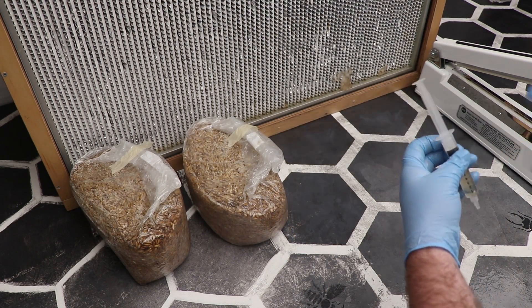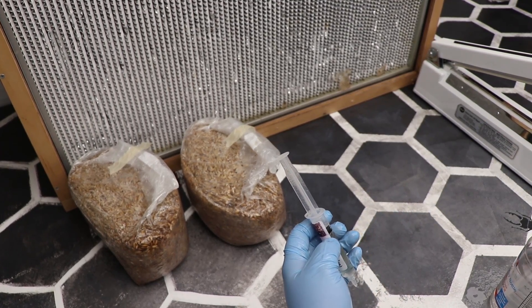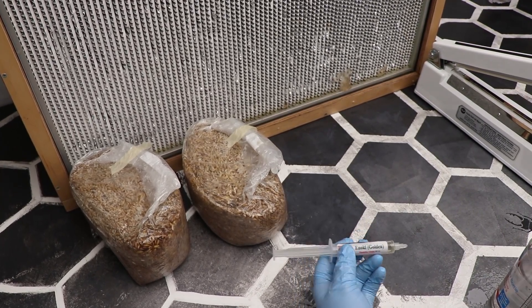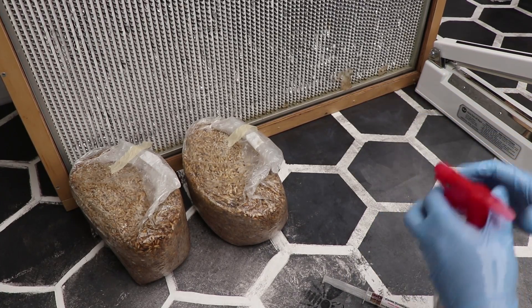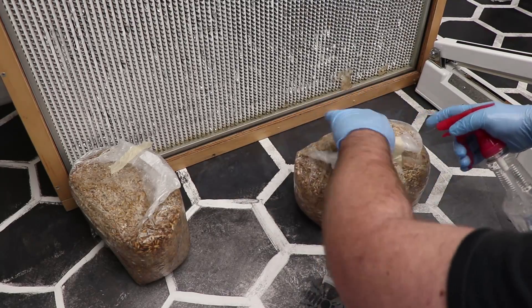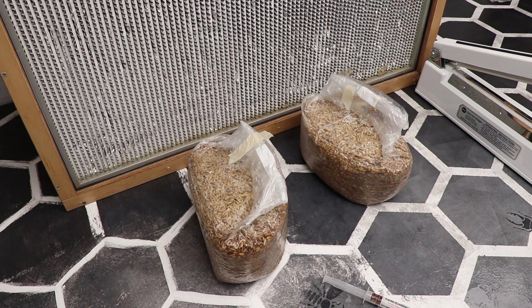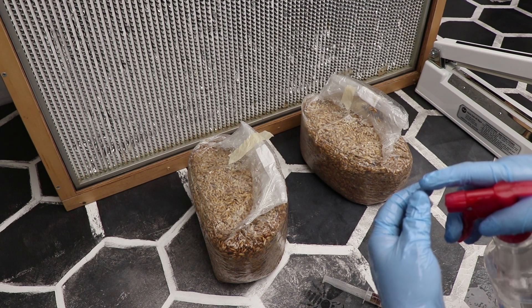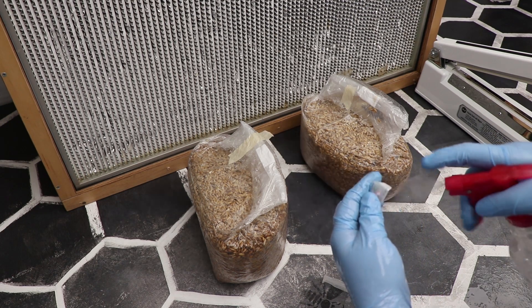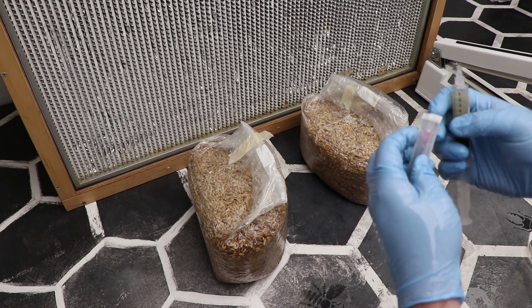I take my liquid culture and spray it down with alcohol. I'm going to make sure that my hands are clean and that my bags are clean. I'm going to take the needle and spray that package down with alcohol. A lot of people don't do this — I like to even get it inside the lip, making sure I spray all of this. Once I've got it sprayed down with alcohol, and I really go crazy, I do not like to set it back down.